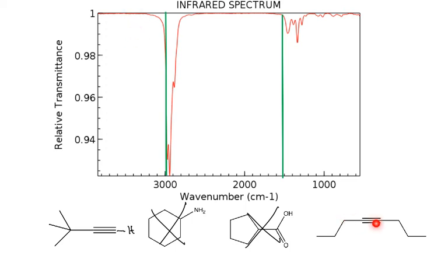And then this molecule is very symmetric. If you remember, for a particular vibration in a molecule to be IR active, when that stretch happens, we've got to change the dipole moment of the molecule. And because this molecule is so symmetric, I don't think this carbon-carbon stretch is going to do much to change the dipole moment. And so that would explain why we're not seeing a carbon-carbon triple bond peak. So, based on the process of elimination, I think we'd go with this molecule.